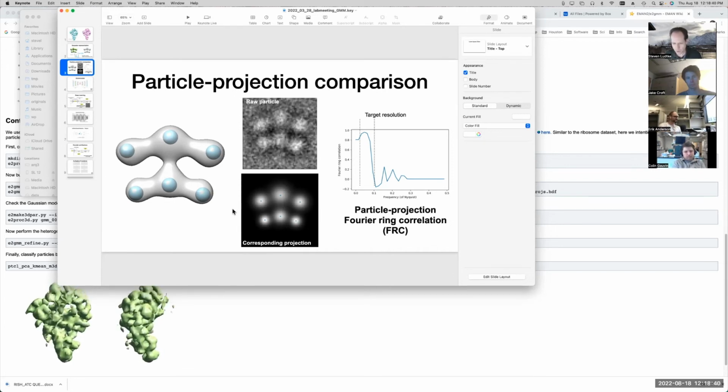Okay. So you can see here, for example, that this Gaussian is maybe a little out of place. This bottom portion is a little tilted, or a little tilted that way, depending on which way you're looking at the screen. So there's a tilt to this. In other words, this Gaussian and this Gaussian may be a little bit out of place. So you can actually compute a gradient for each of the Gaussian variables with respect to the energy that you're computing here, or the other way around. So the amount of change in energy with respect to the change of any of the coordinate positions here.